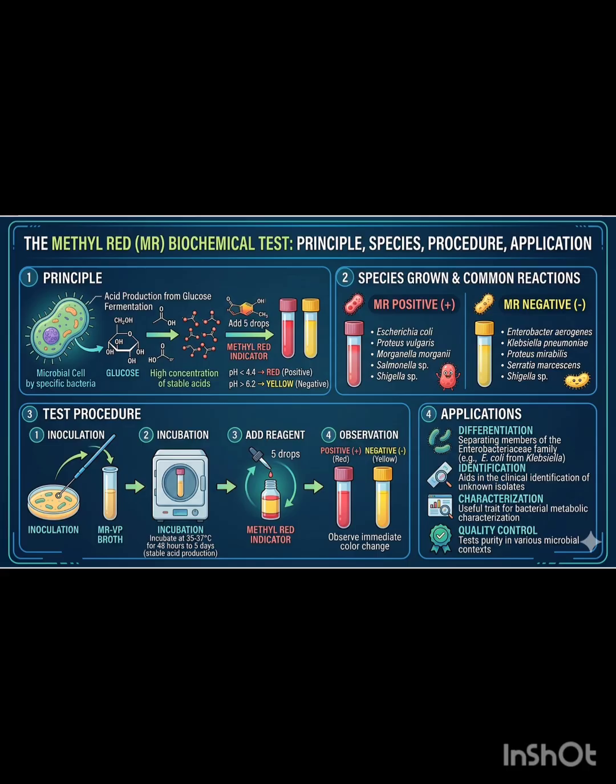Now coming to the methyl red test. What happens in this methyl red test is that certain bacteria will produce acid from glucose fermentation. That is the normal principle of this test.